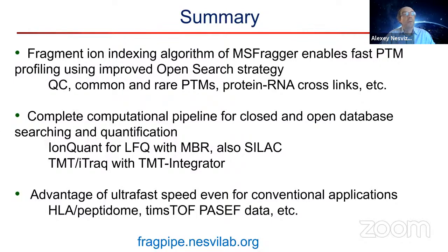Especially endogenous peptidome, if you have to go to a length of 60 or something like this, it will take you forever to run a competitive pipeline, because you have your non-specific search and allow really long peptides. It takes maybe an hour with MSFragger. It probably will take you a week with some other tool to run a search like that, at least based on our collaborations.